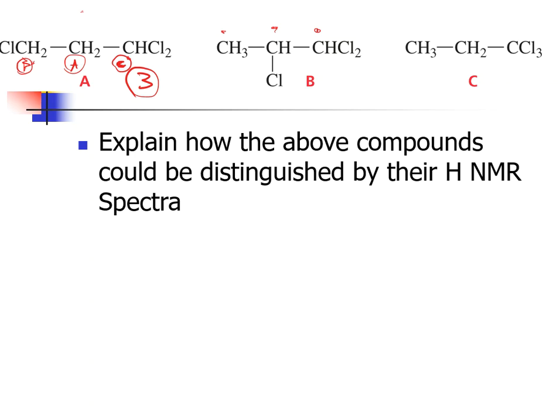All right, so let's rank them anyway. It looks like this CH3 group is the furthest away from any of those chlorines, so that's going to be A. And then this one's probably going to be B. It's got 1 chlorine, not 2. And then because of that, this one is going to be the hardest to flip, so that's the furthest downfield, or the furthest away from 0.